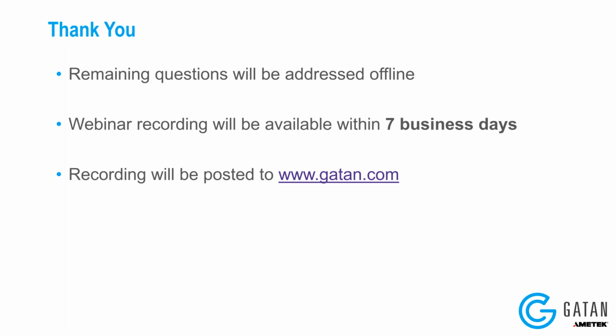This is a question maybe better answered offline, where I can send you some more detail. But the plugin, essentially, the way it works is that it involves a series of simple calibrations that you can do within DigitalMicrograph without the need for any additional hardware. And then DigitalMicrograph can control the microscope to the level needed to maintain everything in alignment as the beam is tilted for you to do a precession experiment.